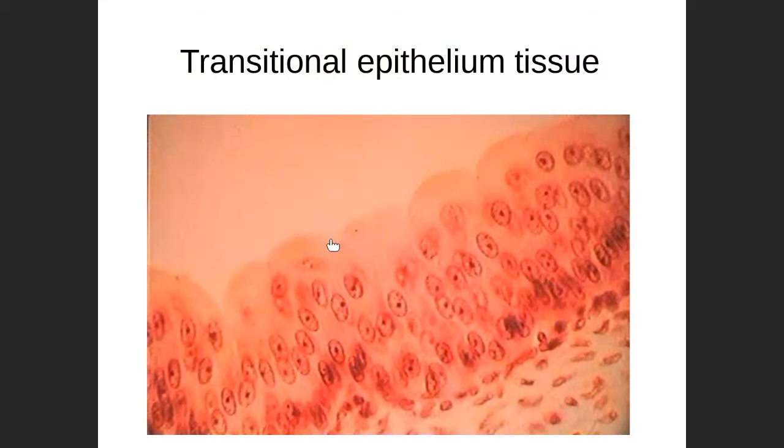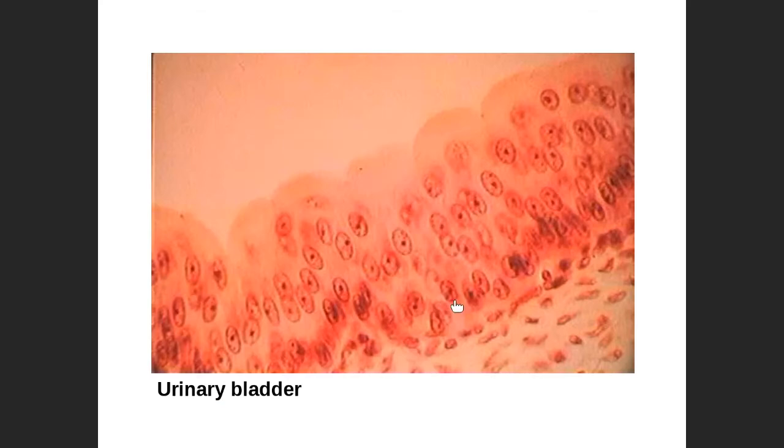All right, but this is the epithelium that changes shape depending on the type of stress that is placed upon it. Be it stress, full bladder versus an empty bladder. So again, like I said, you're going to find this epithelium in the urinary bladder. And when it's a full bladder, all of these cells will be flattened. And when we go through the lecture component or the PowerPoint presentations, we'll see that a little bit more. I can show you both the relaxed and the stretched transitional epithelium.